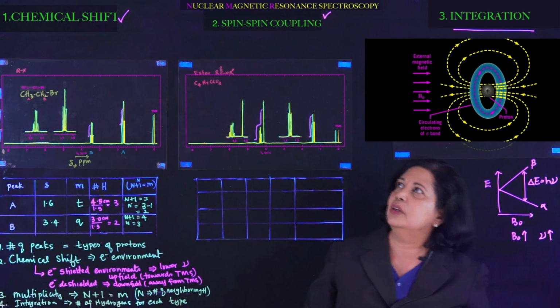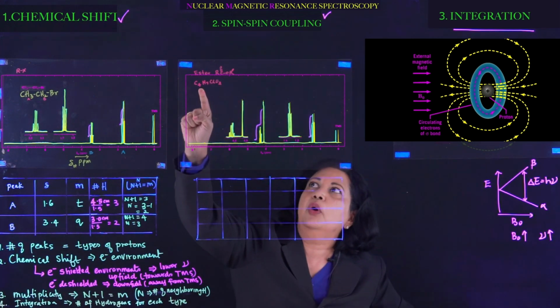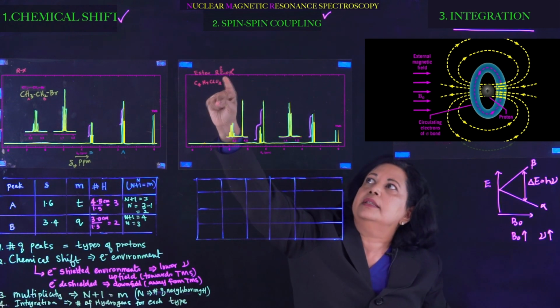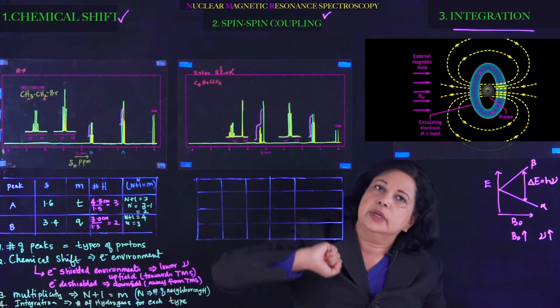All right. So here we know that that's the functional group. We have over here 4 carbons, and we know that one of the carbons would be for the carbonyl. And so we have to know then what's on the left and what's on the right of this carbonyl.